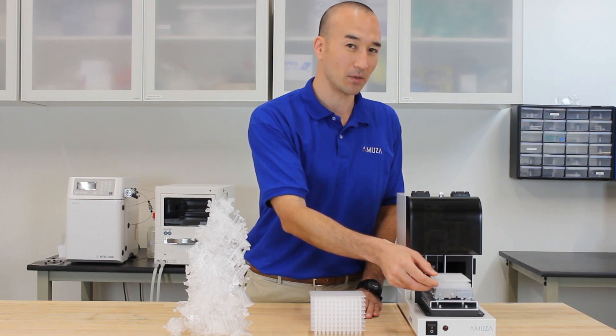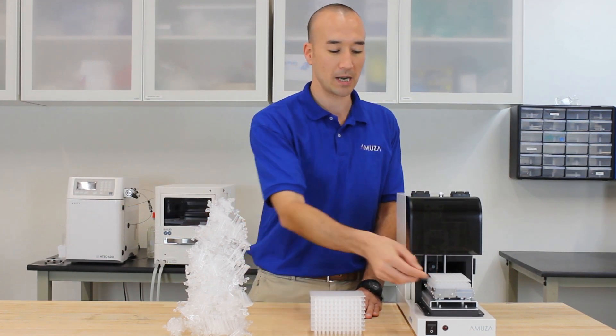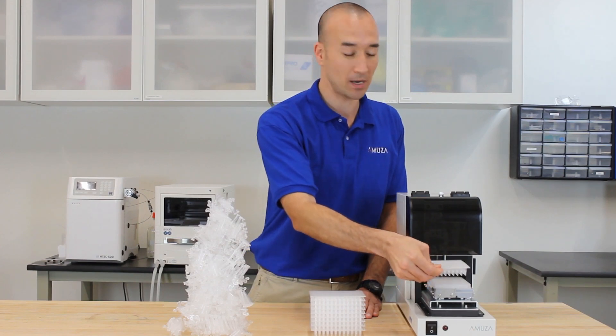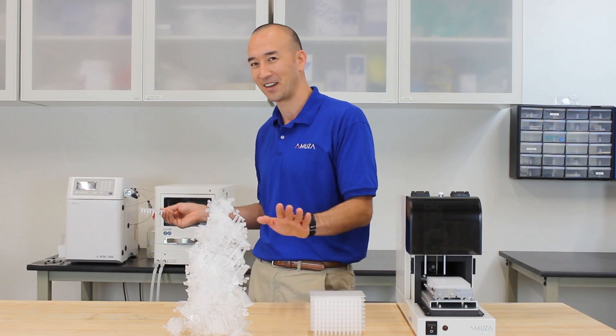Next, when moving your samples, with individual tubes you have to move each and every single one. With a 96-well plate, it's all in one piece — you pick it up, you put it in your auto sampler, and again, done.